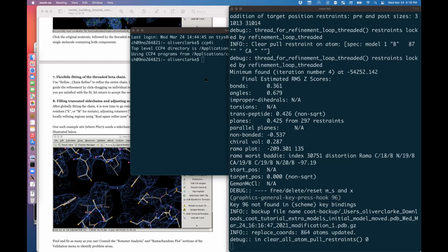What criteria do you look for before deciding to build secondary structural elements or place a homology model, helices, sheets, etc.? So helices and sheets primarily. It's going to vary a lot depending on the resolution range that you are working at. But if you have helices in particular, they should be very obvious isotropic cylindrical sausages at any resolution above about 7 angstroms, really above about 9 angstroms if you have good data.